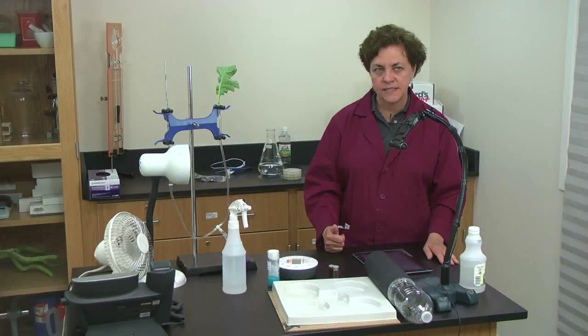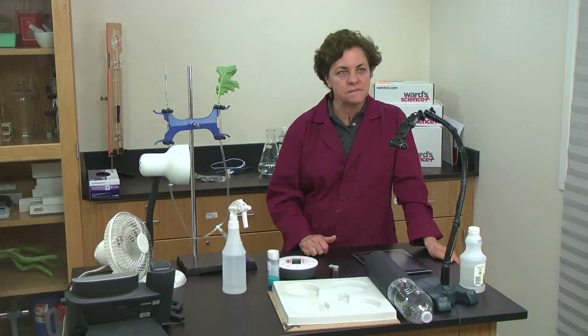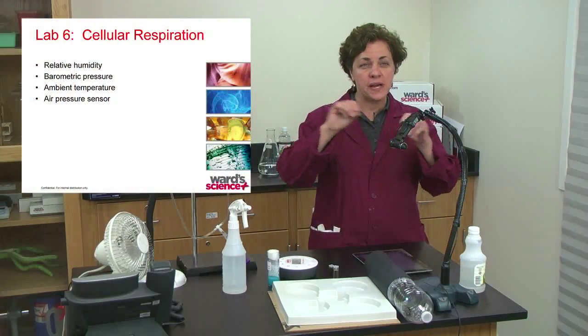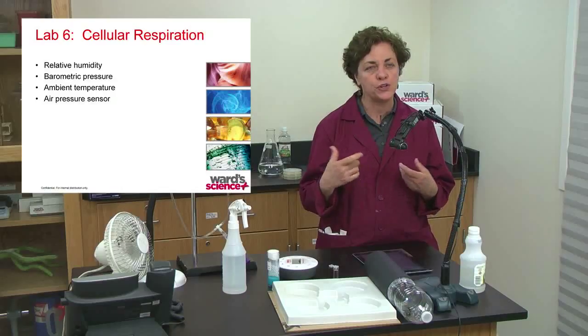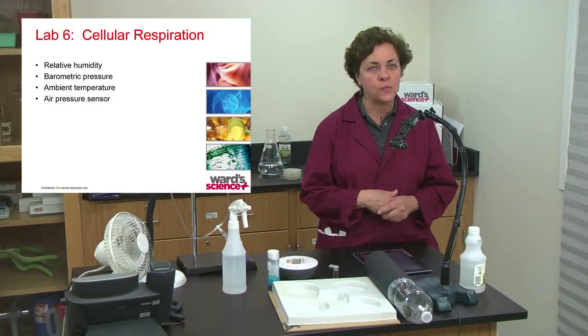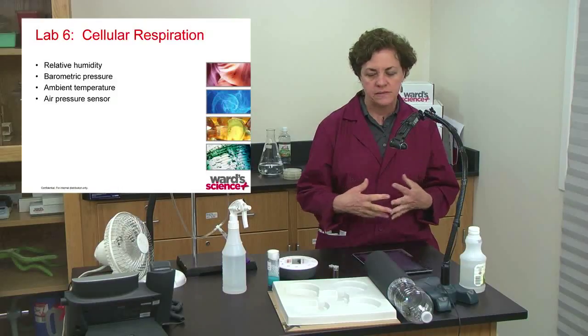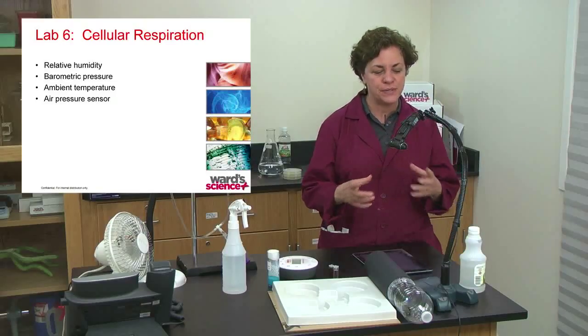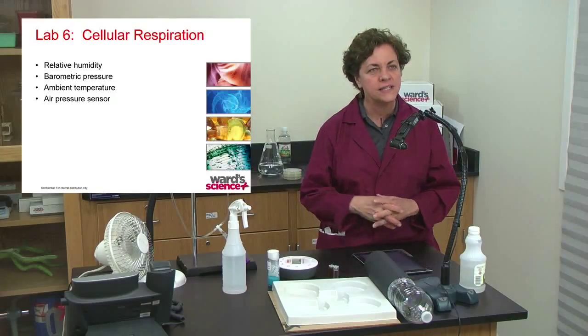Okay, next, so that's photosynthesis. Cellular respiration. With cellular respiration, you have the tubes with the peas in them, or you can have a syringe with flies or pill bugs, or if you're really daring, you could do it with mice, right? Putting a mouse in a tube and testing it that way.